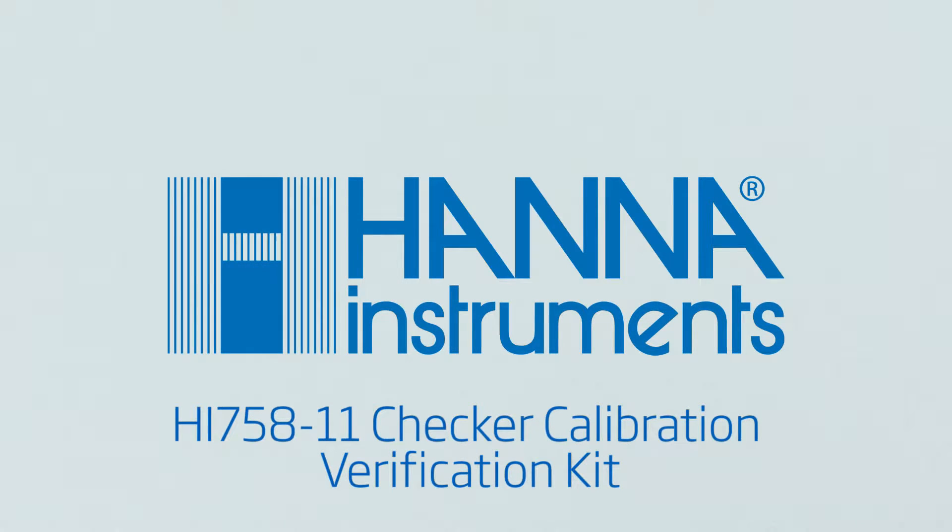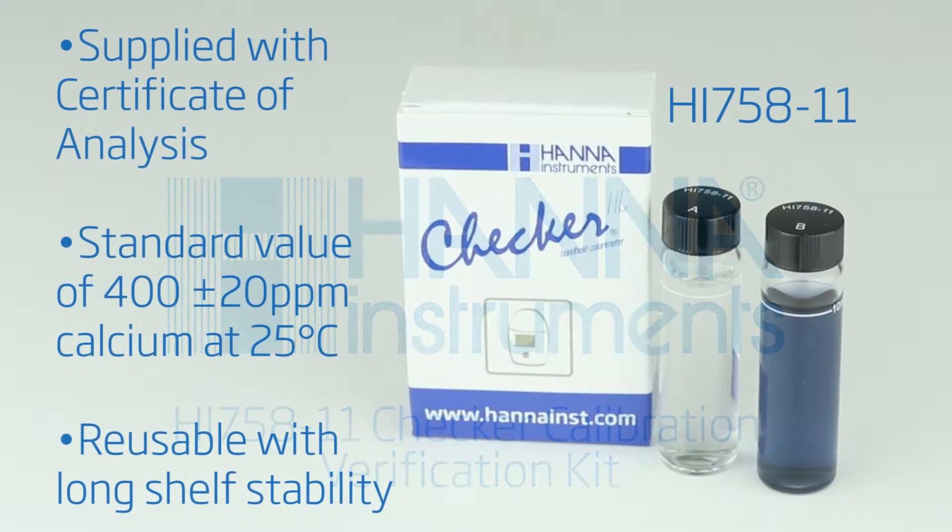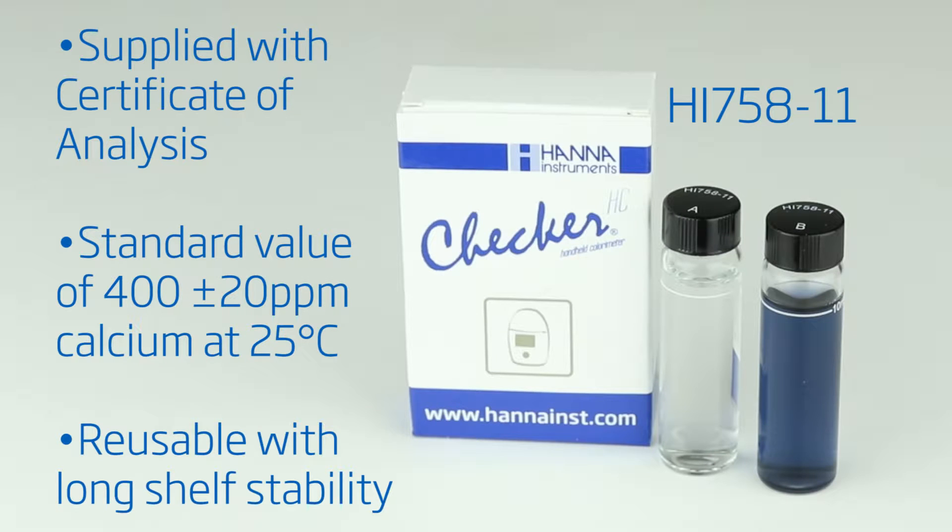The HI-758-11 Marine Calcium Certified Standard Kit may be used to validate the meter. This set includes two sealed cuvettes: one for zero calcium and one tinted to be equivalent to 400 ppm calcium at 25 degrees Celsius.